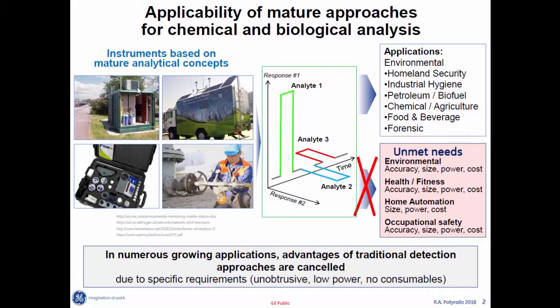So the idea behind using these instruments is to have the complex sample and to push the responses to different analytes, different gases, components in a liquid, such as maybe contaminants, into different directions of your instrument response. And these applications, these are several bullets, they show how broad the applicability of this concept is. And these applications range from environmental and homeland security and all kinds of other ones where those samples are very complicated.